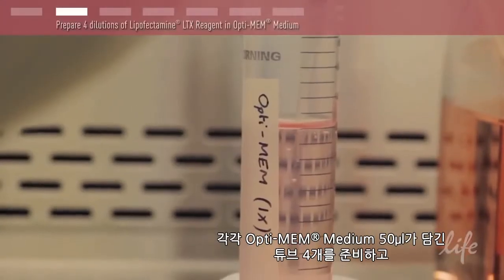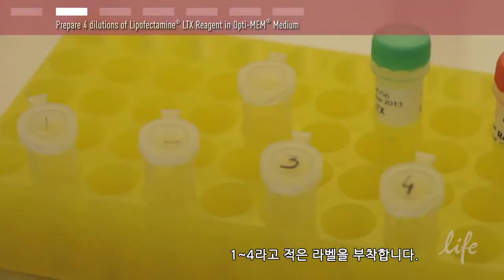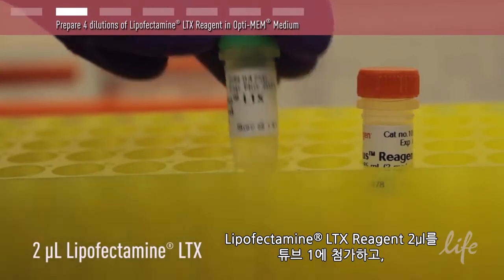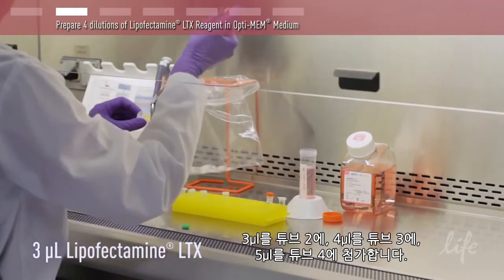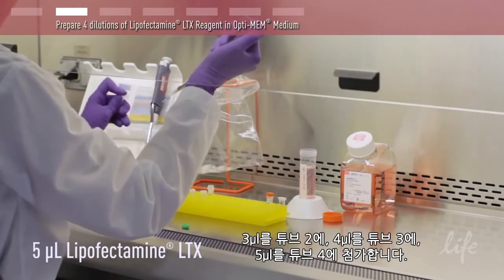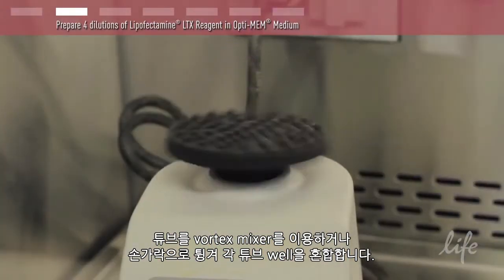Prepare 4 tubes each with 50 microliters of Optimem medium and label them 1 to 4. Add 2 microliters of Lipofectamine LTX reagent to tube 1, 3 microliters to tube 2, 4 microliters to tube 3, and 5 microliters to tube 4. Mix each tube well by vortexing or flicking the tube.